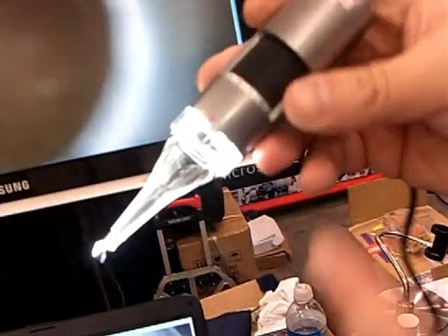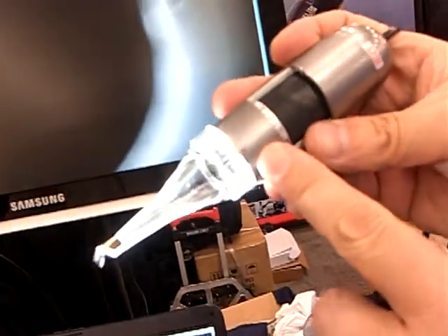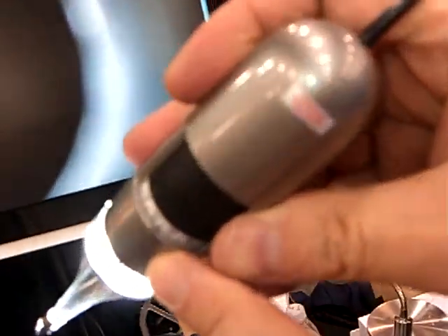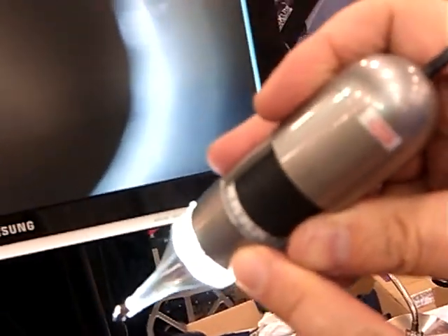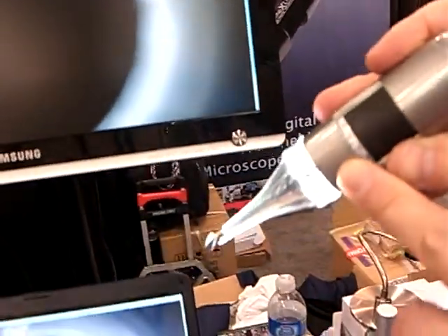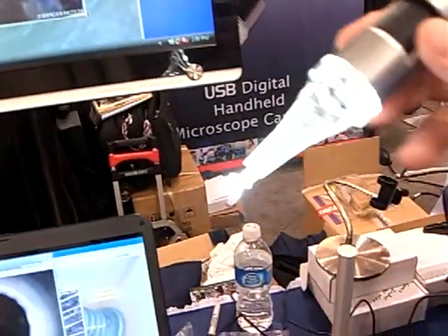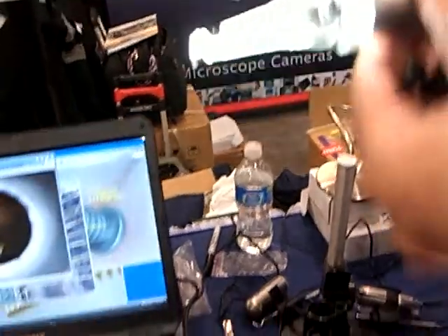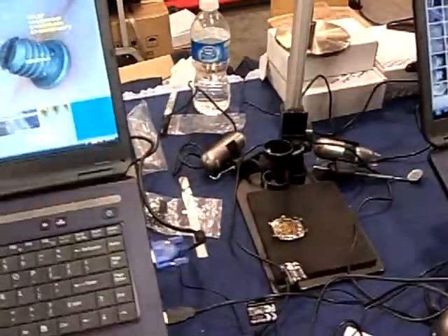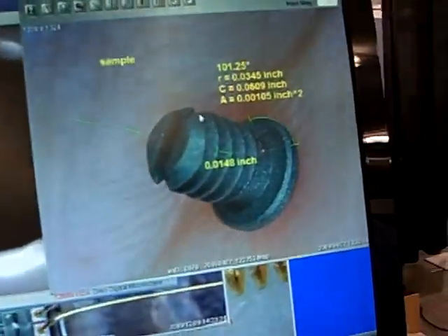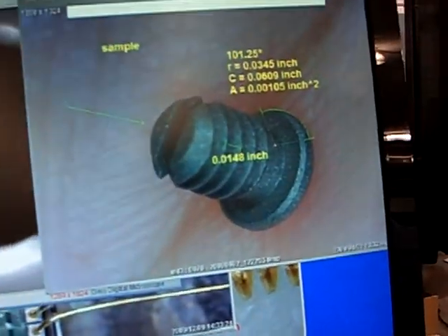Right now we're in the CT5 modification software. After you take a picture, you can do measurements. Here's how easy it is to measure.